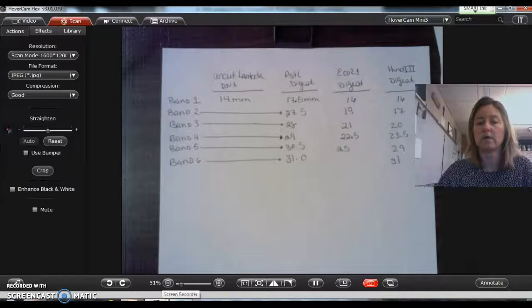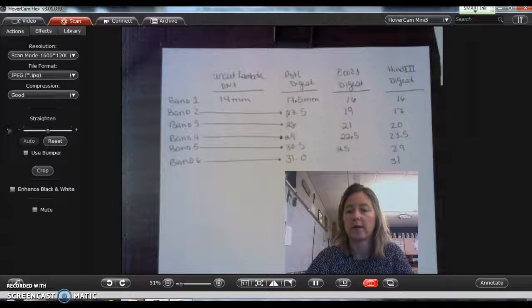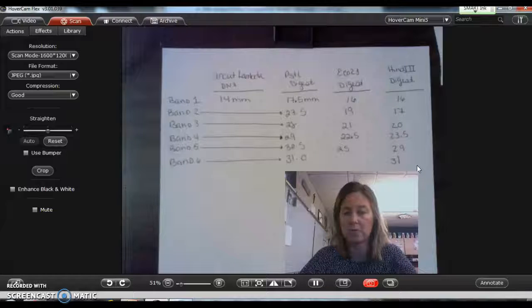And so what you can see here are the lengths of the fragments that they should have traveled. Okay? So if we were doing this in a professional lab, hopefully we would have seen all of these. I know the samples that we did in class, we had quite a few of them, more than we usually have show up. So that was pretty good. So this is the information.